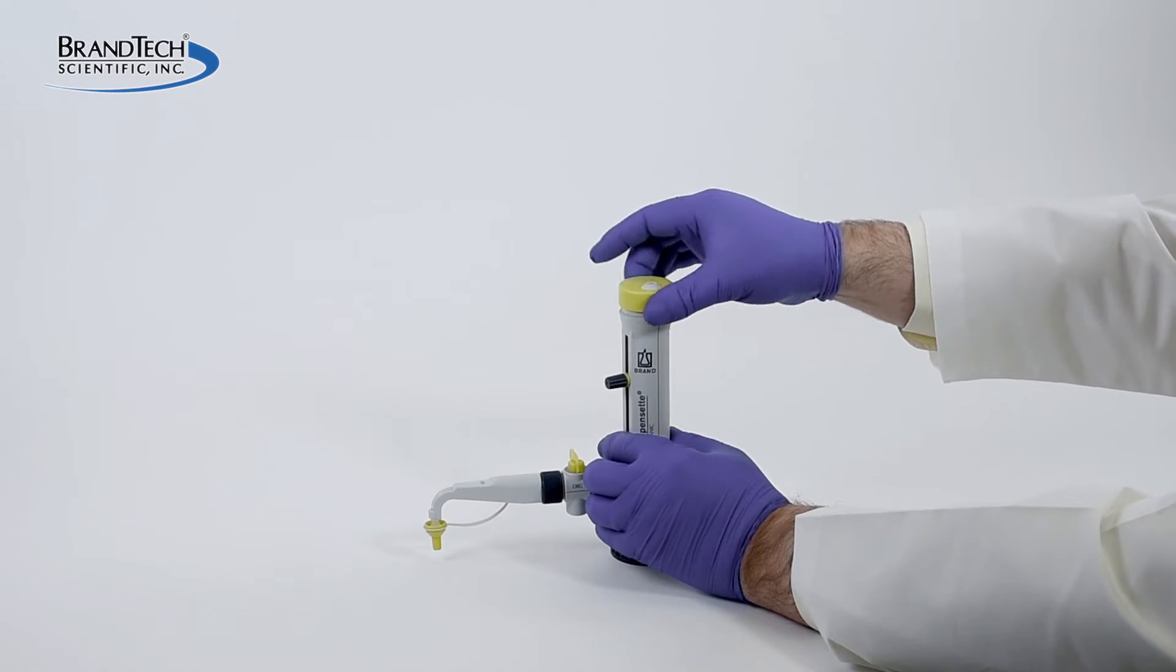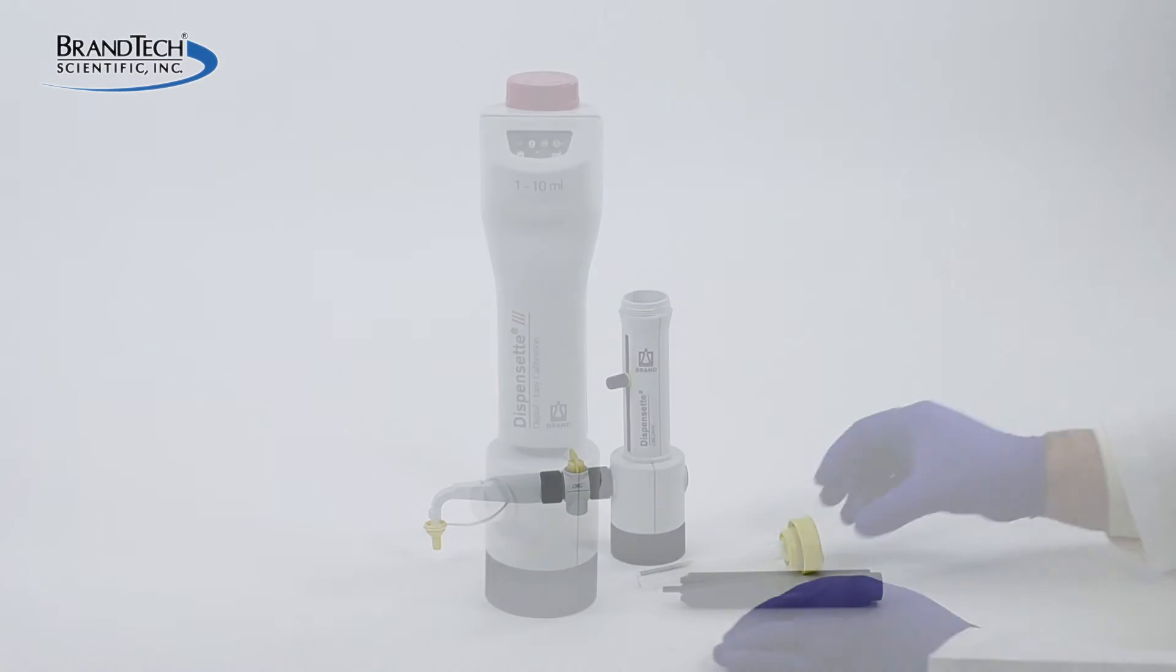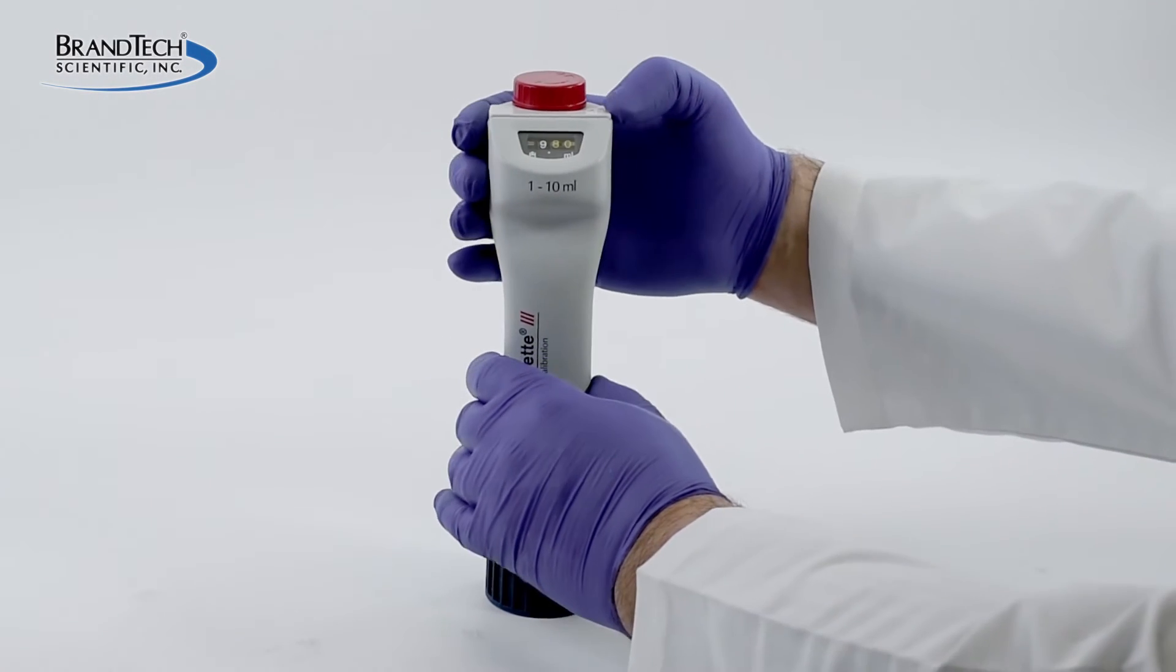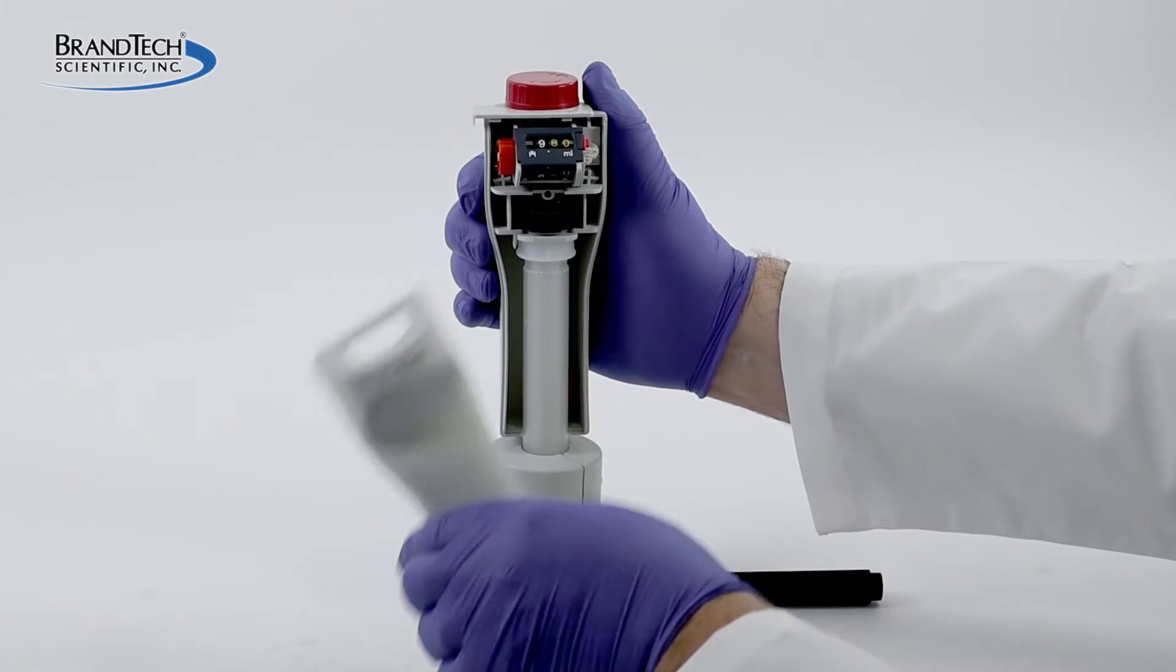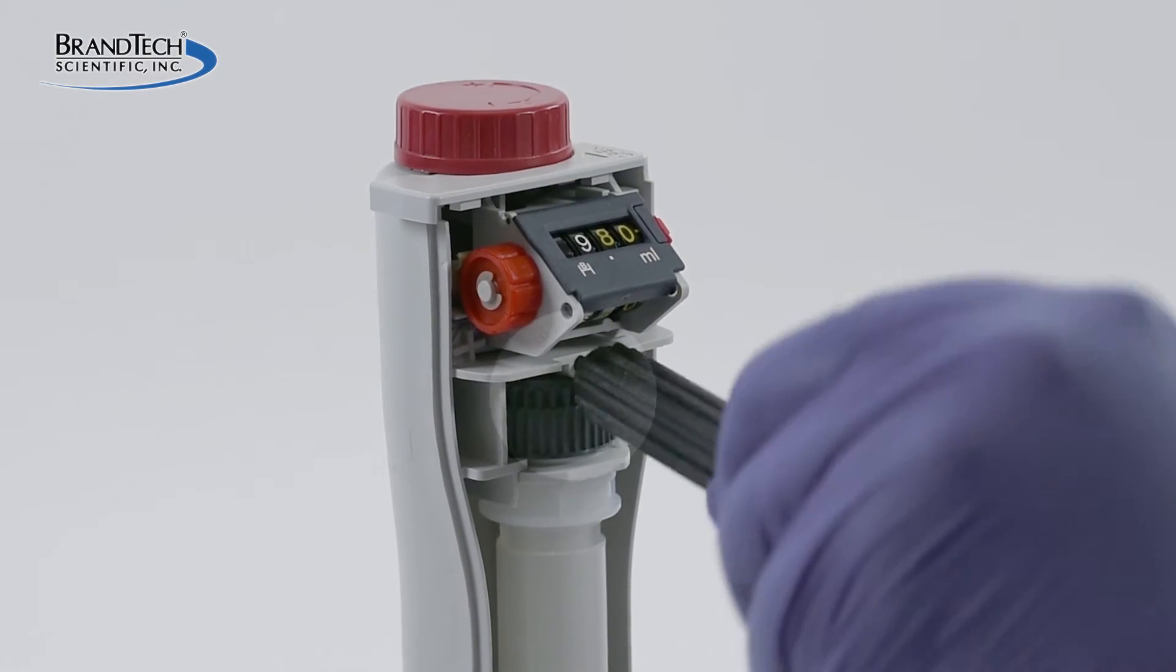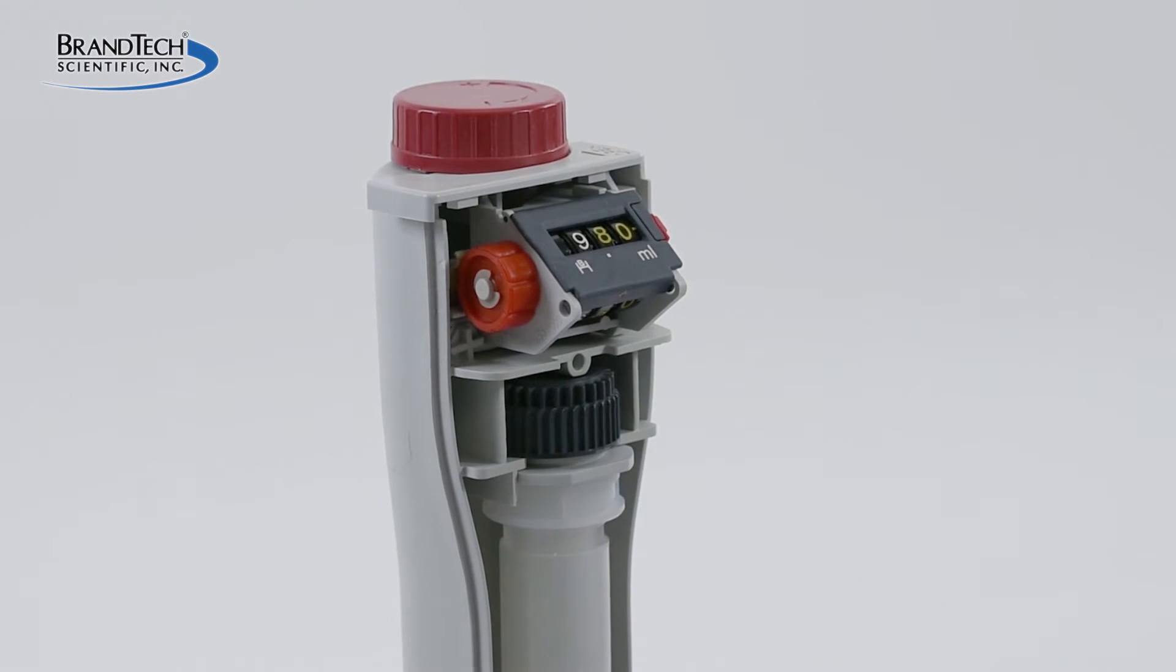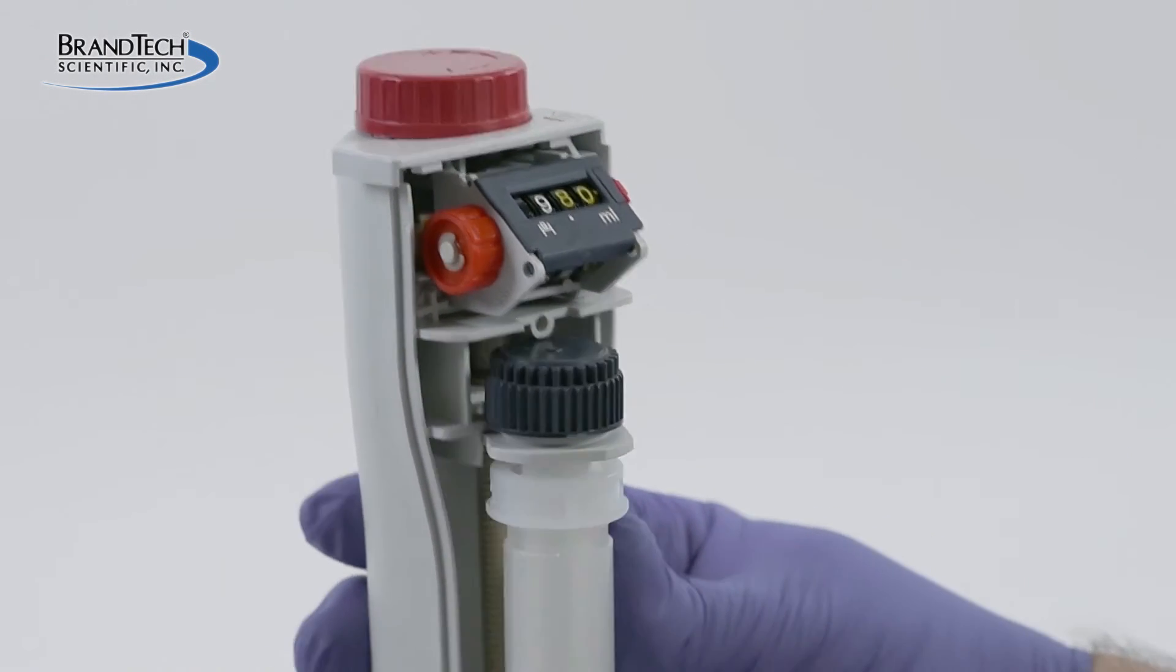If you have an analog or fixed volume, simply unscrew the piston from the cylinder sleeve. For a digital easy calibration model, slide the tab on the top of the housing to the left and use the black valve tool included with the instrument to loosen the cap on the top of the piston. The housing can then be slid rearward and the piston removed.